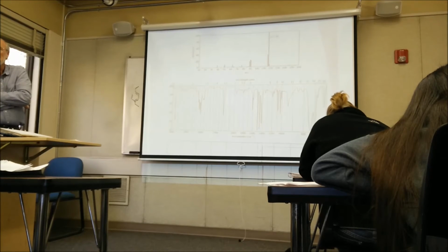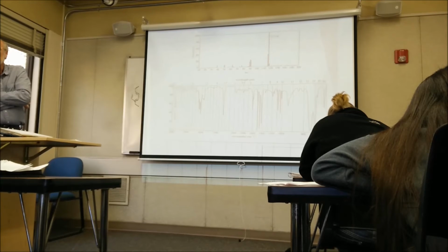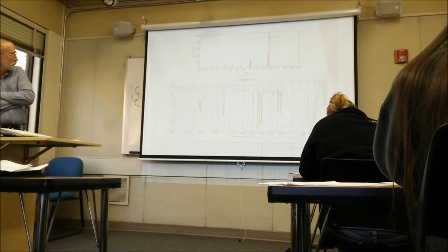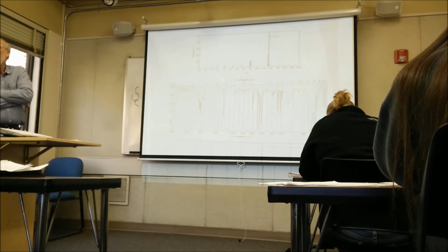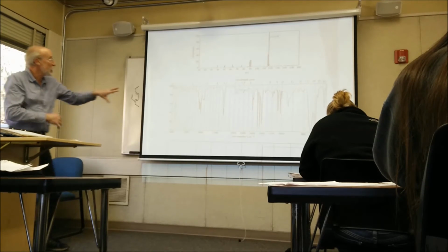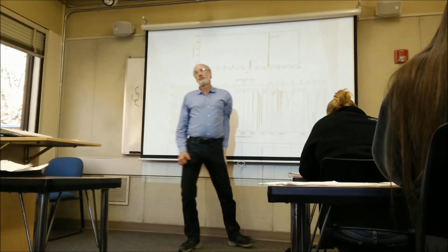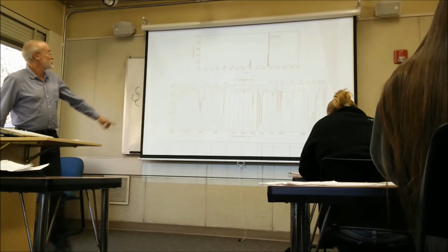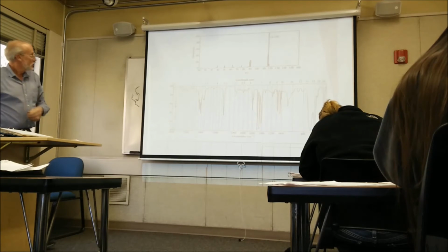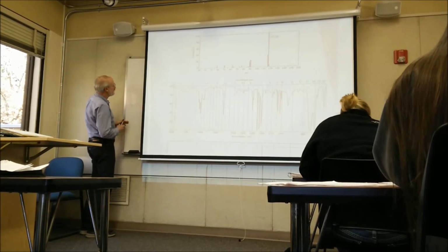In the past, when looking at the nitrogen group on the IR, seeing that small pair of little humps, I wouldn't know whether or not I should take it into account. Yeah, and that's why it's so much better to use all 3 spectra, because you're not sure here, but then you see the odd M plus, nitrogen. So you need to take this seriously. Okay, so if it's 8 carbons, we've got a benzene ring.